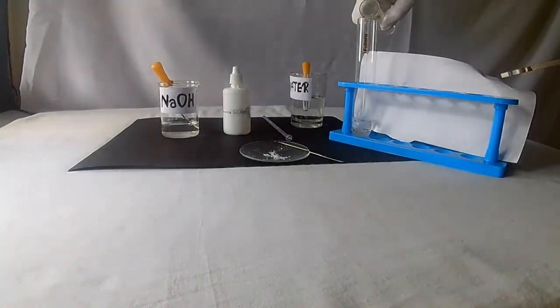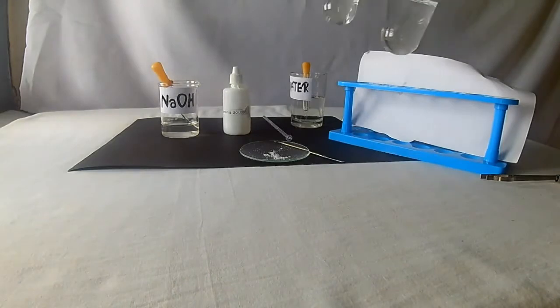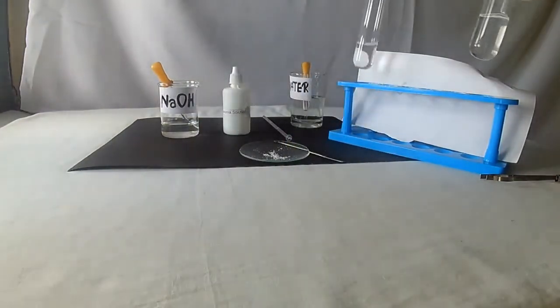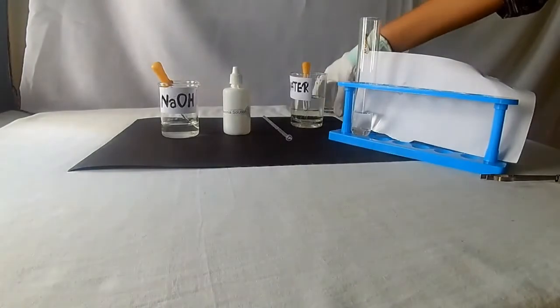Pour it into another test tube. Now the solution is ready. Take one part of the solution to perform sodium hydroxide test.